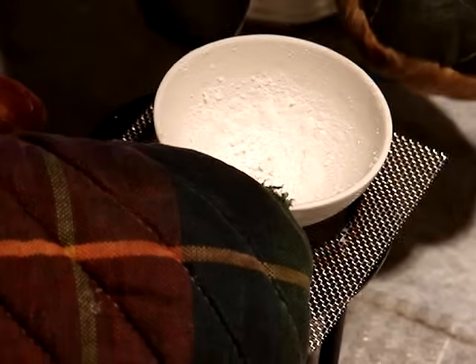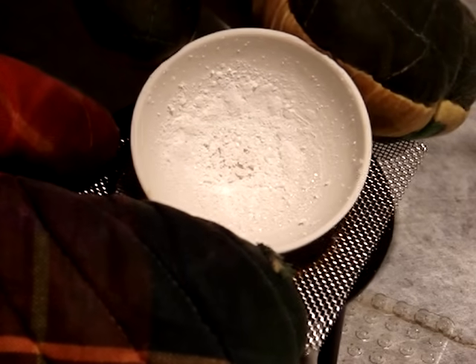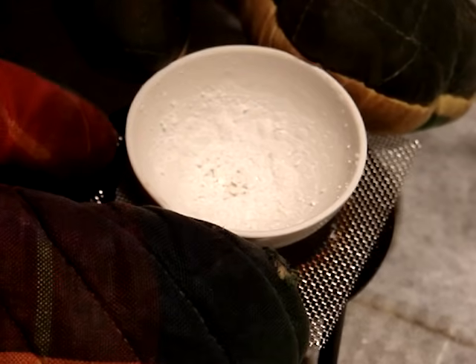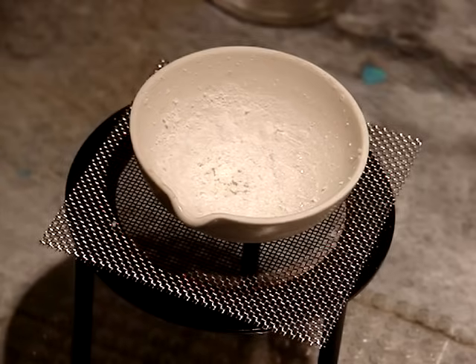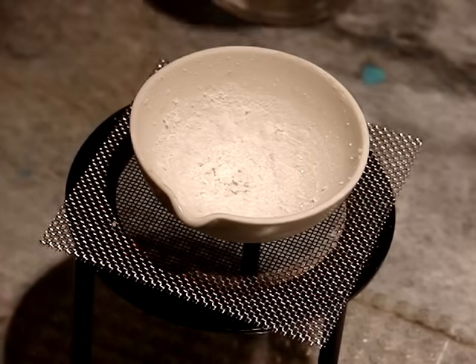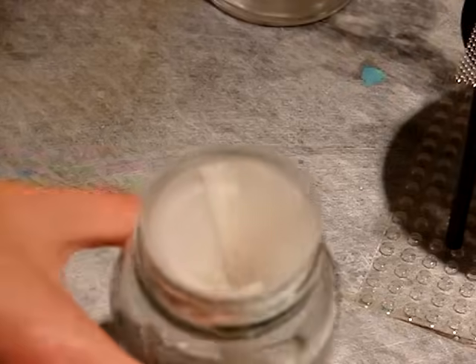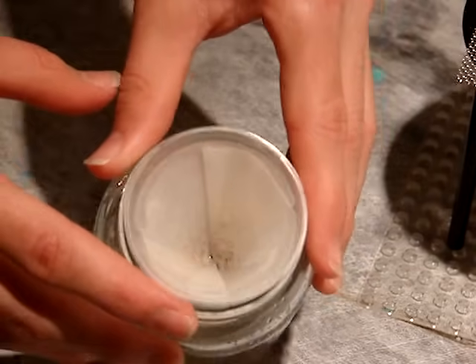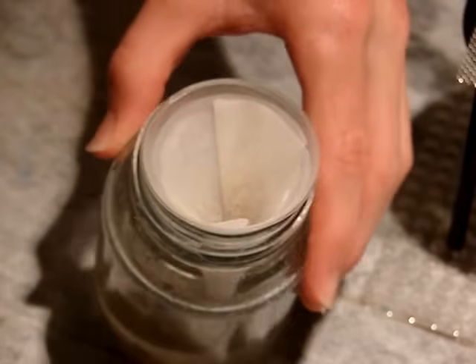Okay, so now I'll tilt the salt right here and see if the camera can catch it. Okay, so there's a bunch of salt left in the jar. And then over here, we have the sand that was left in the jar after we filtered it. And there's a little bit of sand left, and after we filter more, we might be able to see more. But yeah, and there's still some left in the jar.